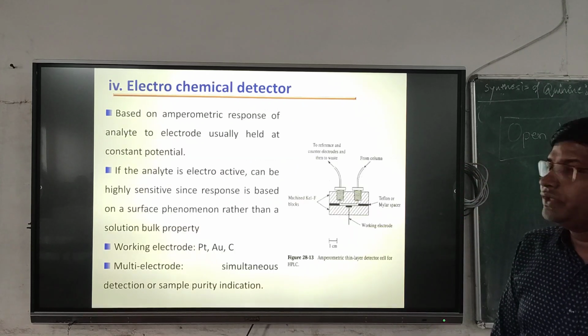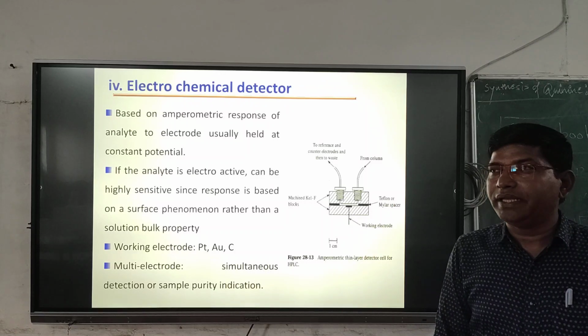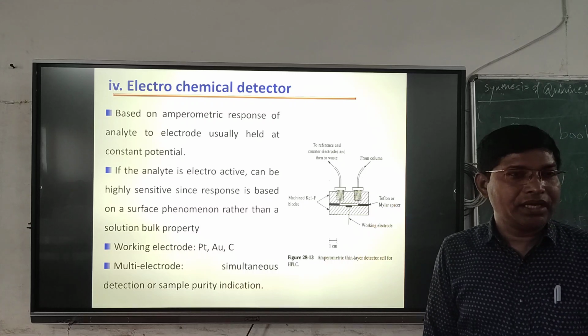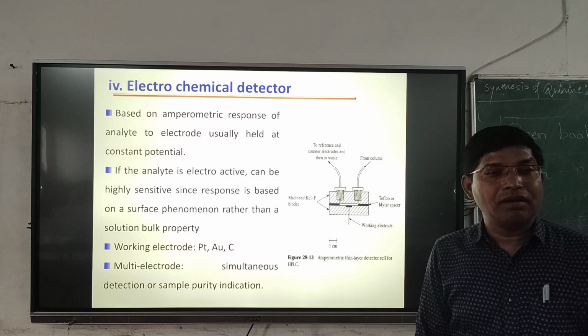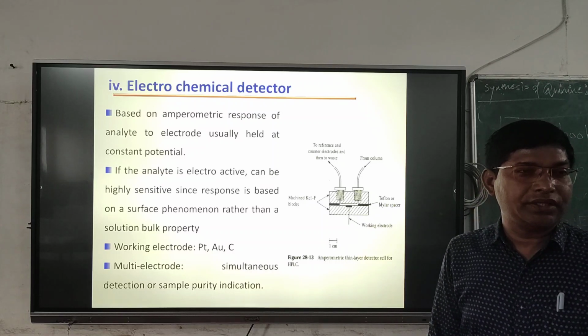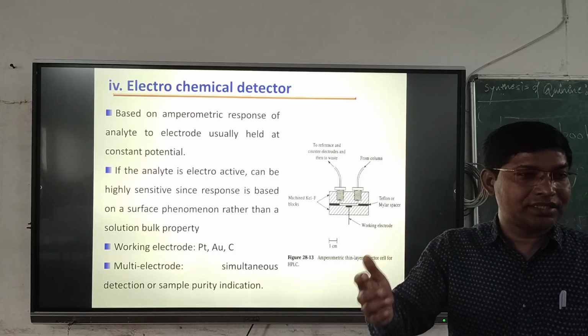And we have an electrochemical detector, which will increase the sensitivity as well as the selectivity. This is for compounds which are electroactive. Electroactive means having an oxidation or a reduction property.